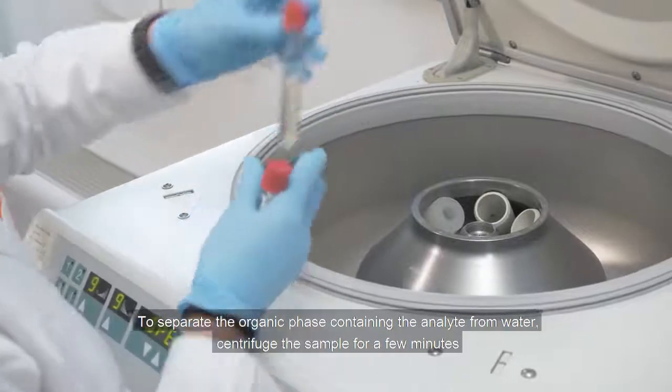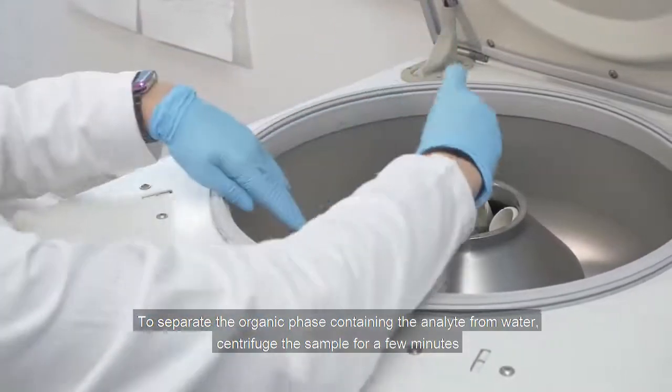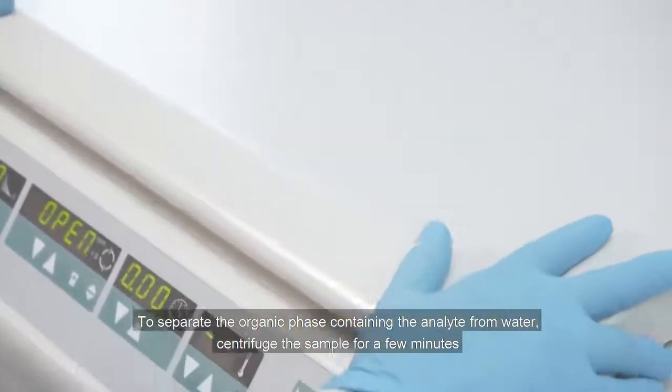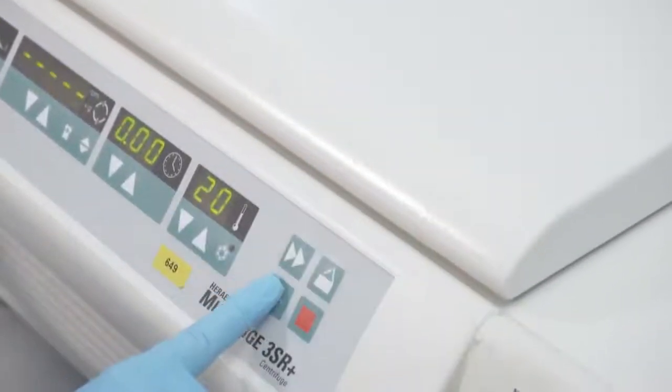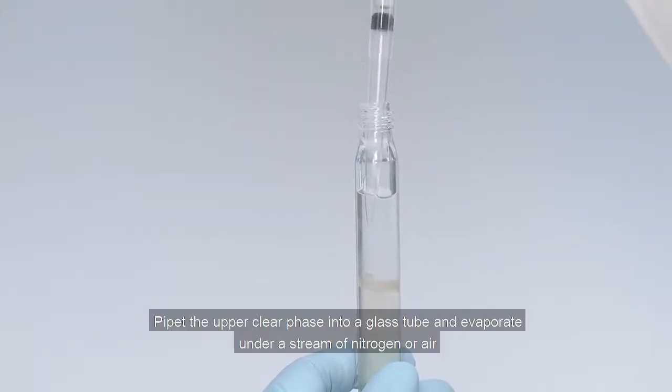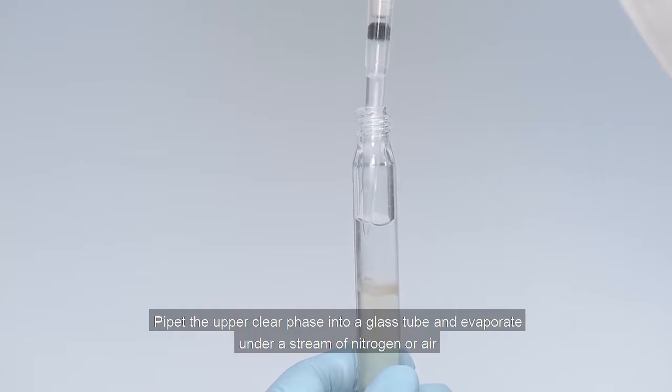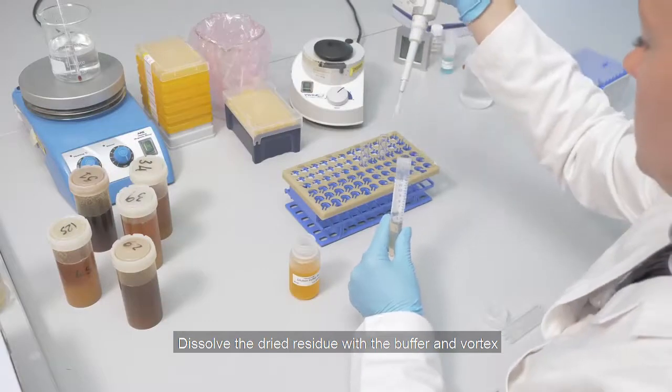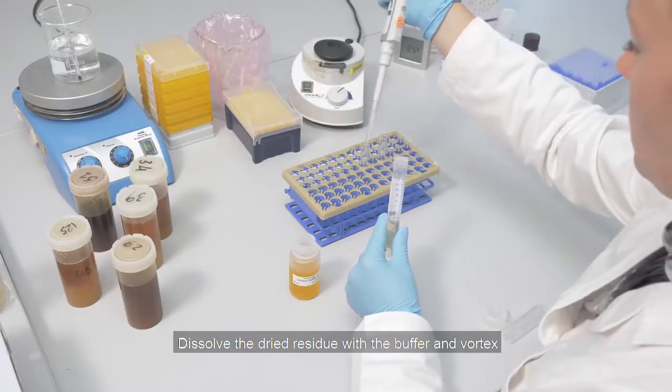To separate the organic phase containing the analyte from water, centrifuge the sample for a few minutes. Pipette the upper clear phase into a glass tube and evaporate under a stream of nitrogen or air. Dissolve the dried residue with buffer and vortex.